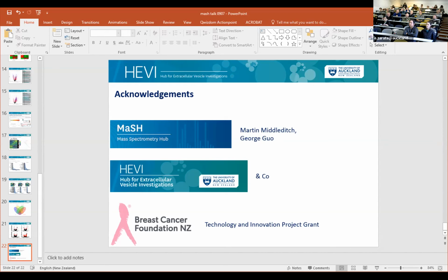As I've said, MALDI imaging is quite labor intensive, and this is the 4 big S's of it. A lot of the work is in the sample prep. To start with, you need to cut up the tissue. You need to slice it. We use a cryostat, freezing these berries. Unlike people who get the luxury of working with animal tissues, which are high in protein, plants are low in protein and high in water, and water is not your friend when it comes to freezing in a cryostat. It's like sectioning a glass marble, basically. So it's tricky to work with, but after a bit of work and a lot of swearing, I managed to get some reasonable sections in this example.